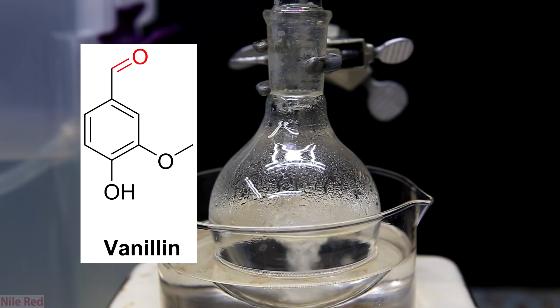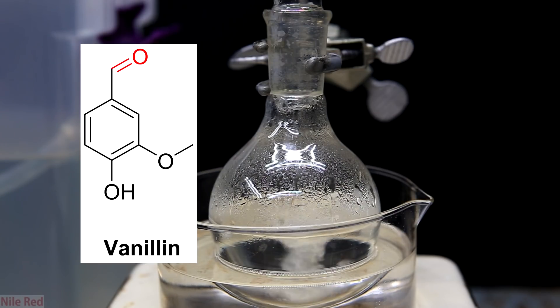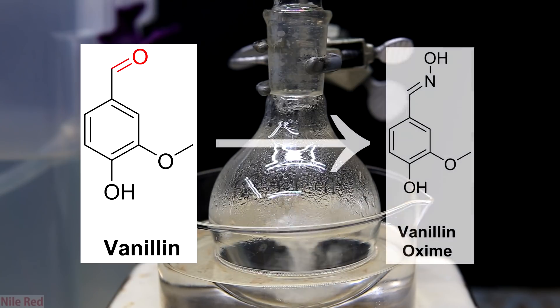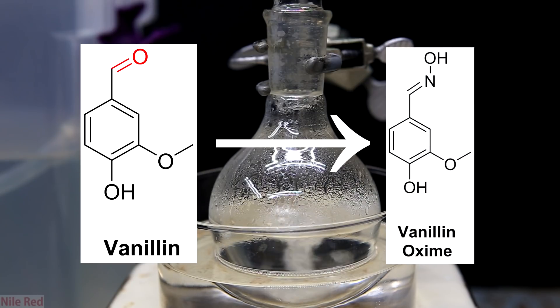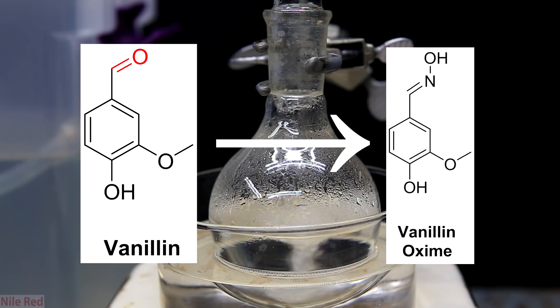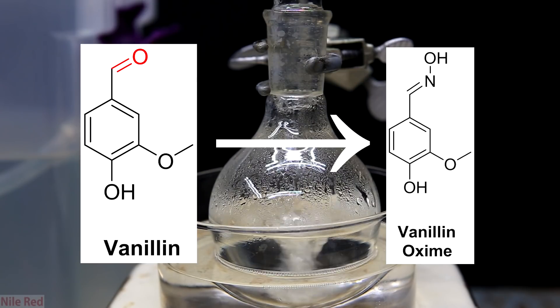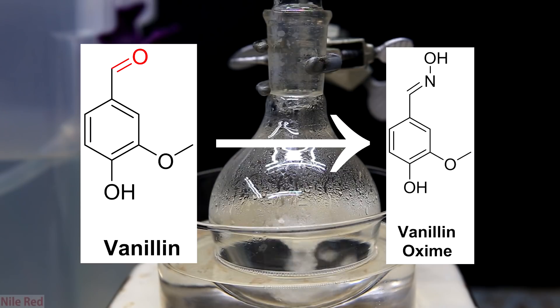In the case of vanillin I've highlighted in red the aldehyde and we're going to convert this to the oxime. The reason for converting it to the oxime is because the oxime is able to do different chemical reactions. The oxime has some pretty cool and niche applications and I won't get into these now but what we plan to do was convert the N and the OH to just an NH2. This reaction is known as a reduction and once this is done we would have the final product of vanillyl amine.